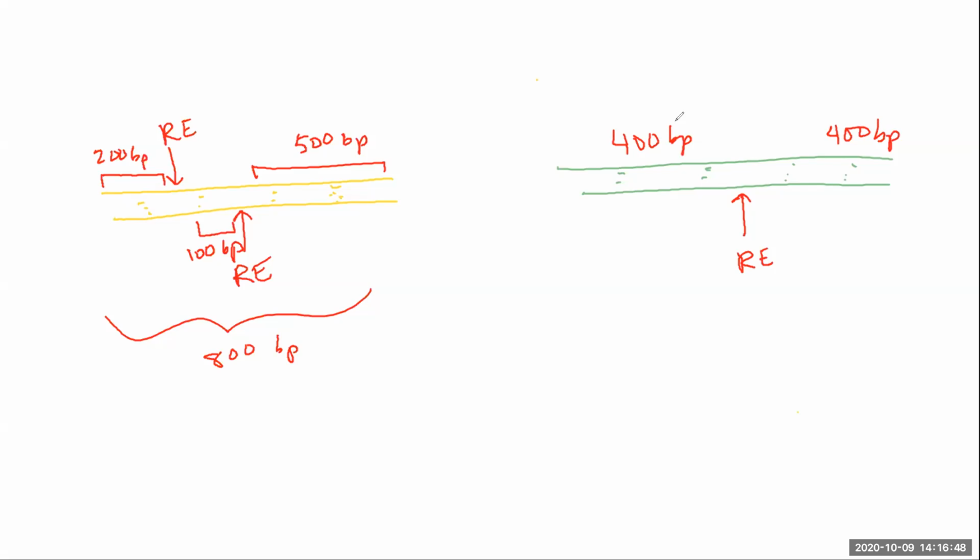All right, so why is this important? Now we want to ultimately run it on a gel. And that's what the second part of your experiment is going to be about. Let's think about these gels that we use. They are called agarose gels.